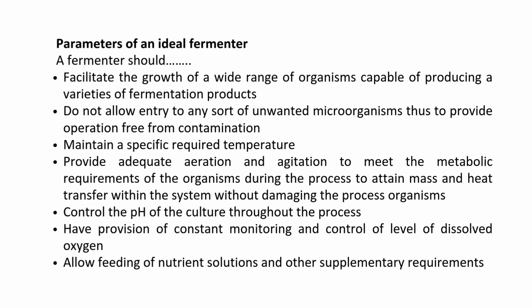Parameters of an ideal fermenter. Now, what are the parameters of an ideal fermenter? A fermenter should facilitate the growth of a wide range of organisms capable of producing various products. It must prevent the entry of any unwanted microorganisms, providing an operation free from contamination. It needs to maintain a specific required temperature and provide adequate aeration and agitation.